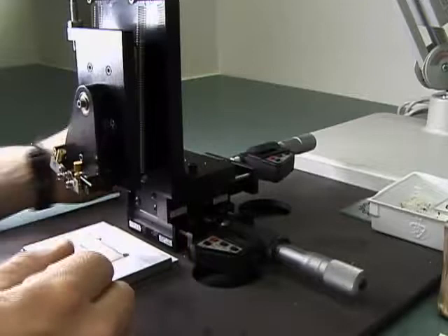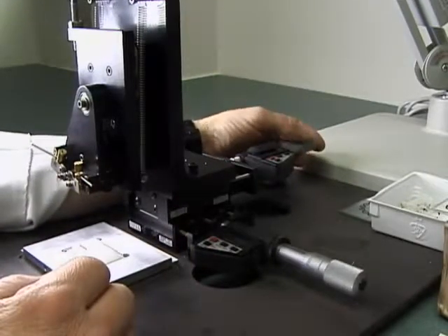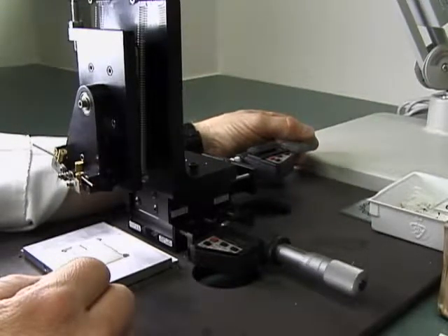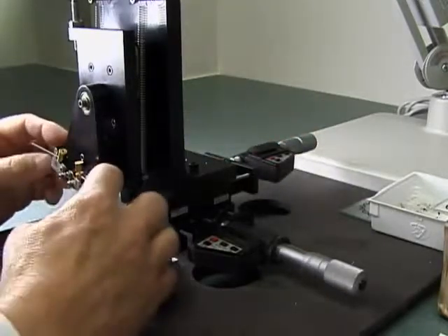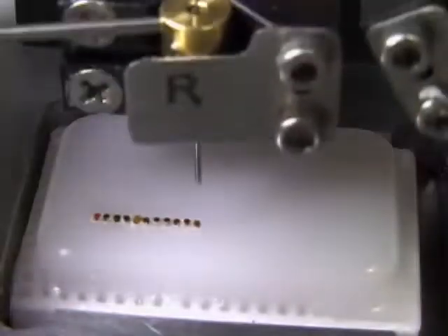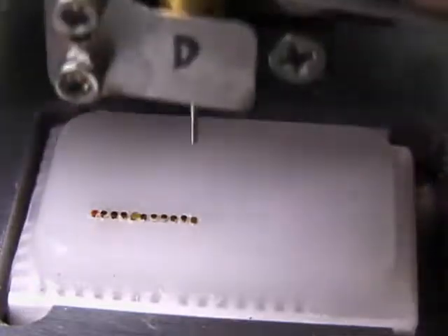Once you reach the end of a row, move the micrometer guide to begin another row. Use the same interval distance you began with. The punches in this array are all 1 millimeter apart. If you have to stop in the middle of punching a group for any reason, always double check yourself. Make sure you are on the right row and the right specimen. This is where most mistakes occur.